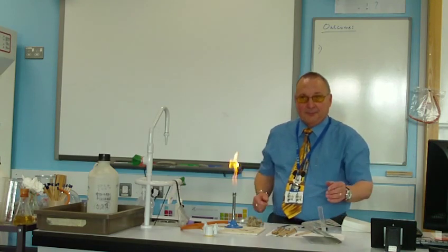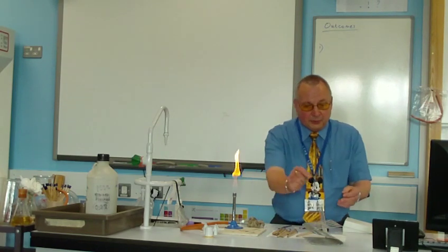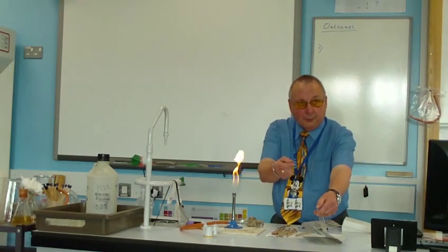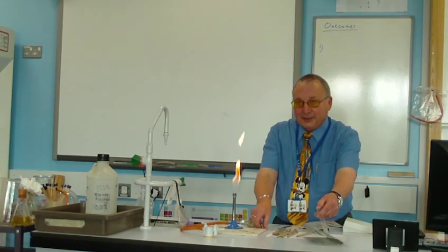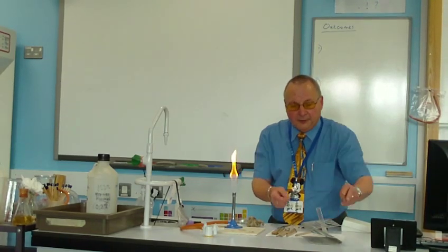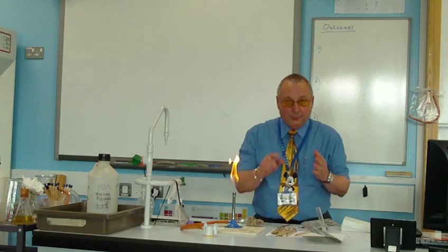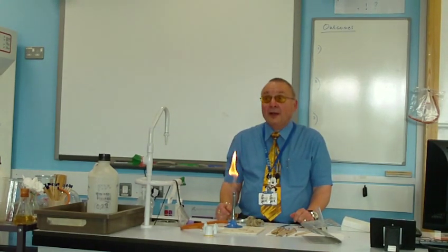If you've got some magnesium left, it might work a second time. You don't have to lift this up or anything. You drop the magnesium in, thumb over. The other member of the group comes with the splint. As soon as you take your thumb off, when you come in with a splint, don't burn his or her finger. Wait till they've removed the finger and then put it to the mouth of the tube.